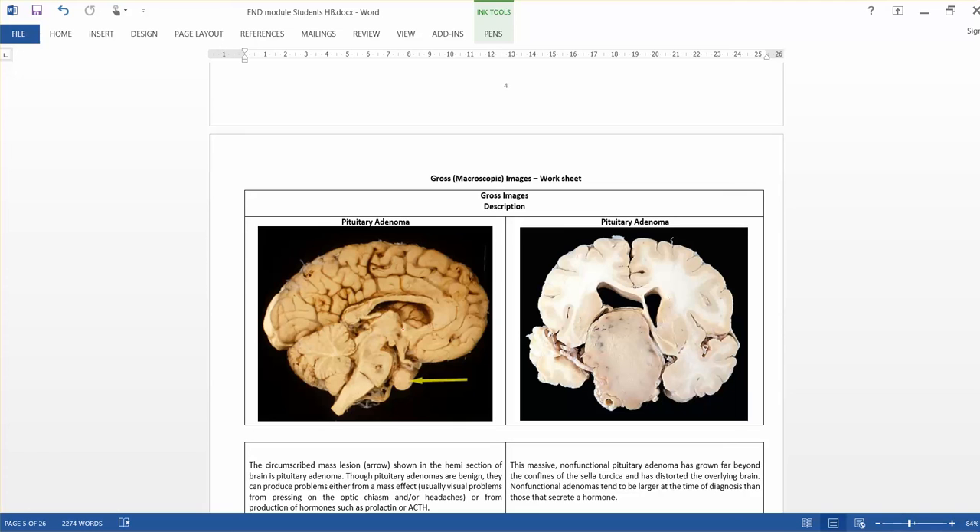Now let us go into the laboratory sessions for pituitary gland pathology. This is a hemisection of the brain. Concentrate on this area — there is a small nodule which expands the pituitary gland, and it is slightly compressing the surrounding area. This is the pituitary adenoma.